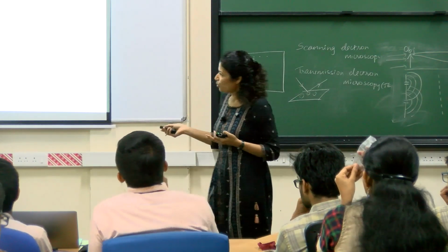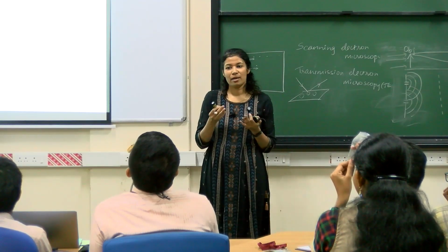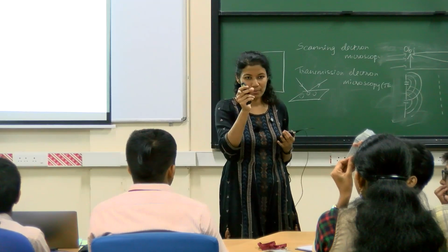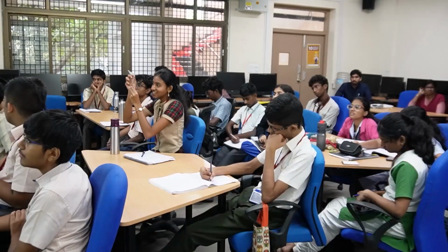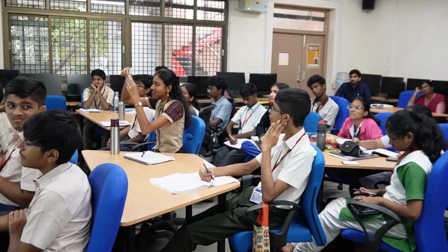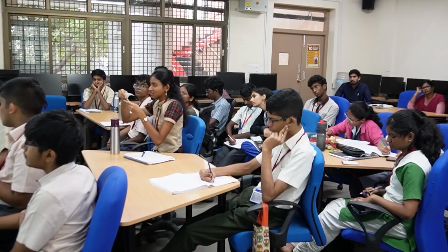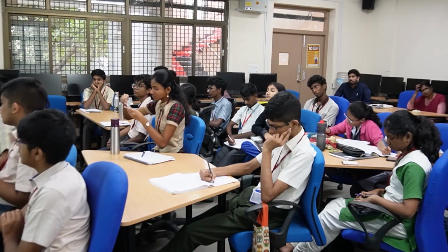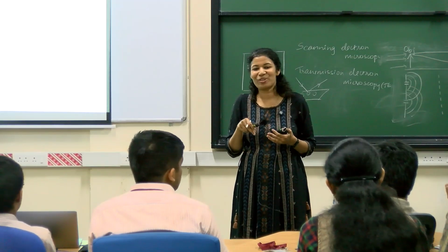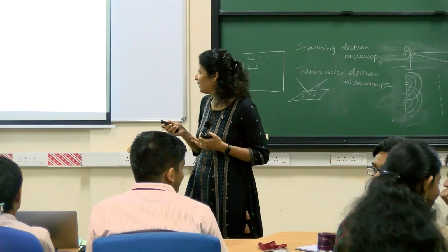So I just wanted to show you all one basic simulation. There are two grids in that. One of them you can move around a little bit. One of them is held in a support, which we need when we are mounting on the microscope. Another one is a little open. But you will not be able to see how the squares look. You need a magnification, some kind of microscope to look at that.